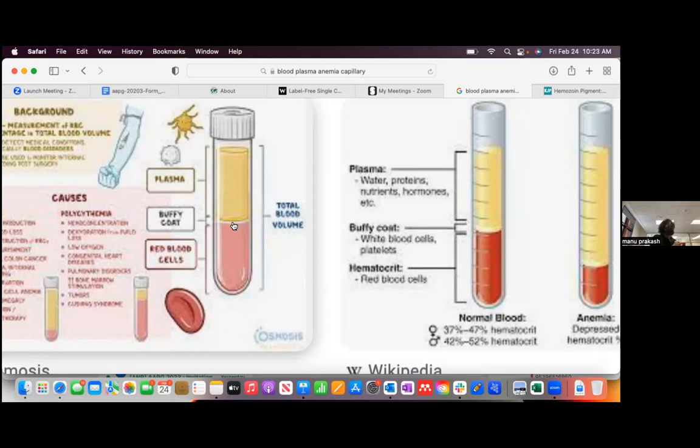So if you had to come up with it, it's a very clever idea, and I'm just curious if it falls intuitively to some of you. What we want to do is, this is density A, this is density B, this is density C, but you want higher resolution, kind of in a picture. When you want higher resolution, what do you do? You zoom in. So can you think of a mechanical way of zooming in? Yeah, take out these parts and then rotate it again. So you could spin that again.